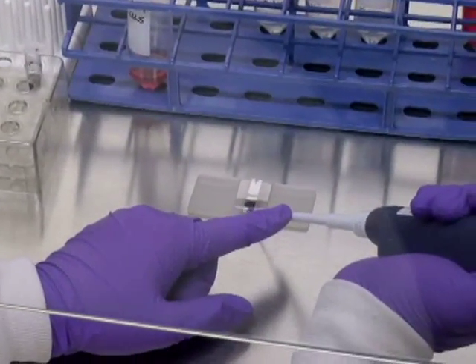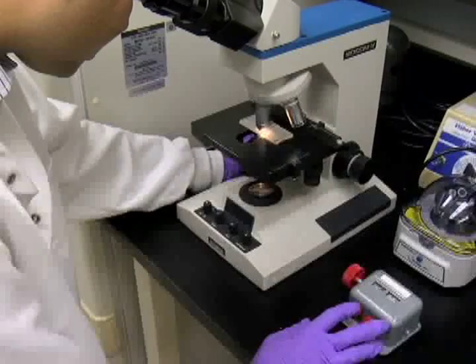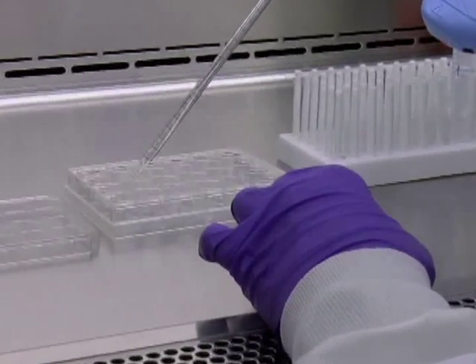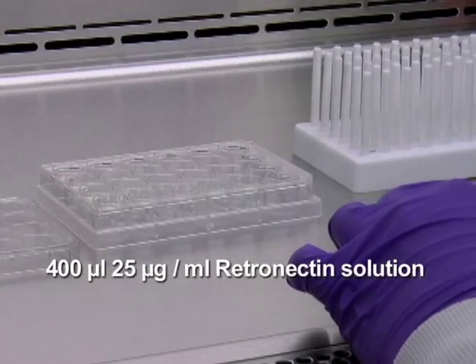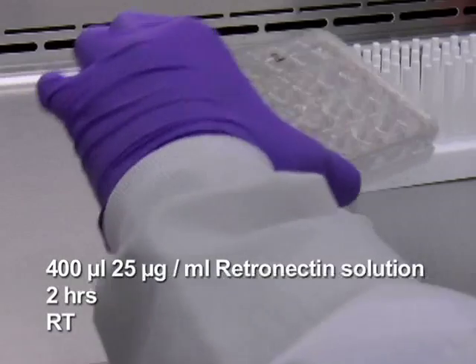On the day of transduction, count cells before starting virus preloading to determine the number of wells to be prepared. In order to precoat a 24-well non-treated tissue culture plate, add 400 microliters of 25 micrograms per milliliter retronectin solution to each well and incubate for 2 hours at room temperature in the laminar flow biosafety hood.